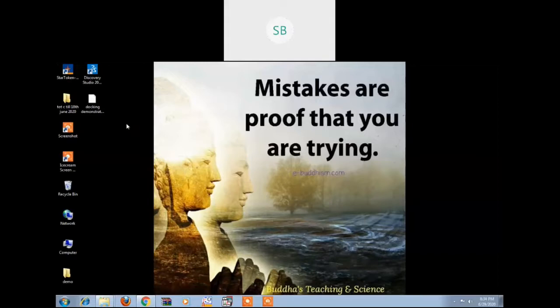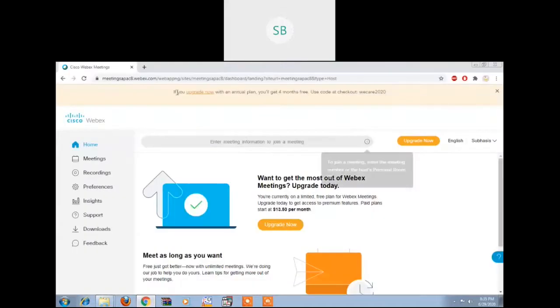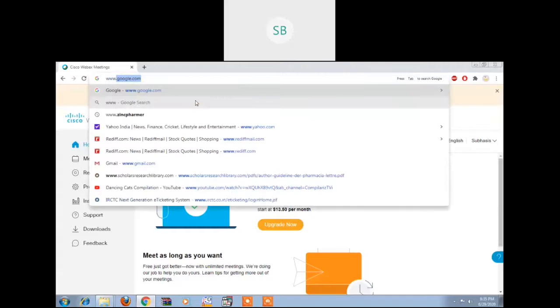Now, without wasting much time, today I have chosen a particular target here. The target is the reverse transcriptase enzyme, and the purpose is to inhibit the reverse transcriptase with a suitable ligand, right? So first and foremost, let us go to that site where we can get the protein. As I said, the target is reverse transcriptase. So let me take you to that particular site where you can get the protein.